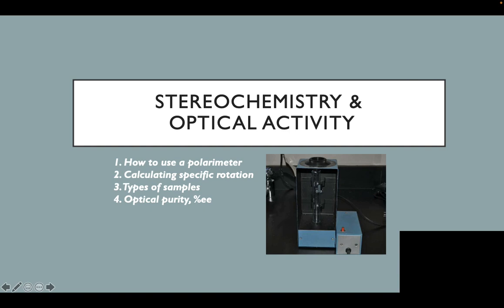Hello, welcome to the Stereochemistry and Optical Activity Lab. In this video, I will show you how to determine the optical activity using a polarimeter.